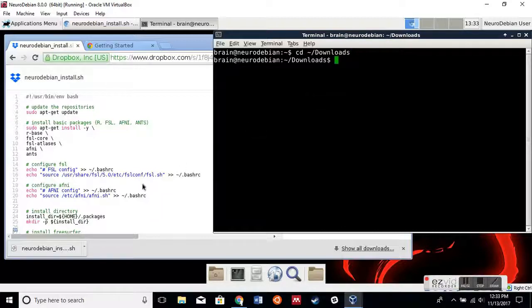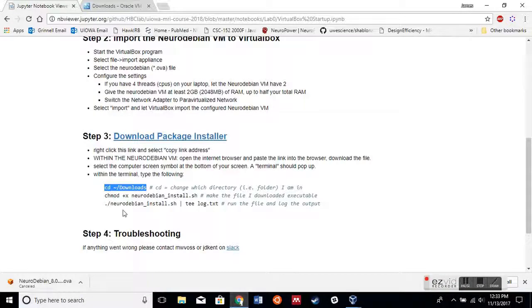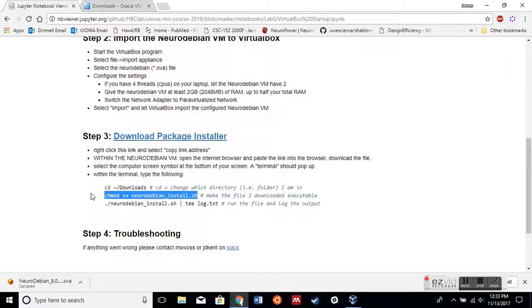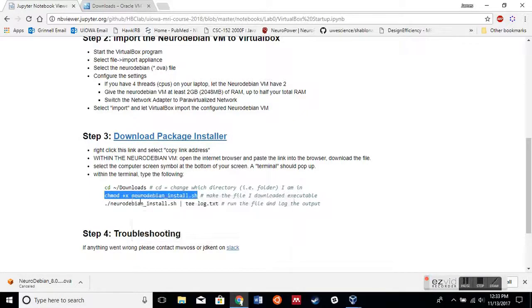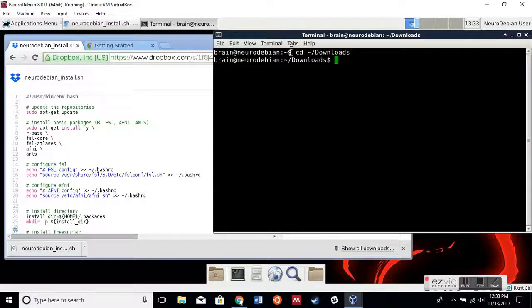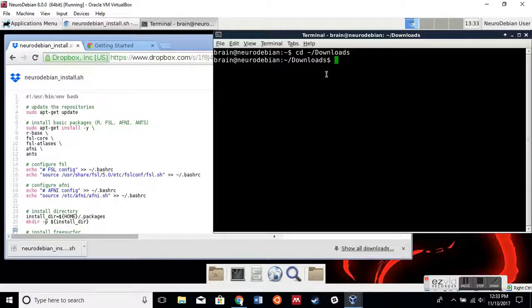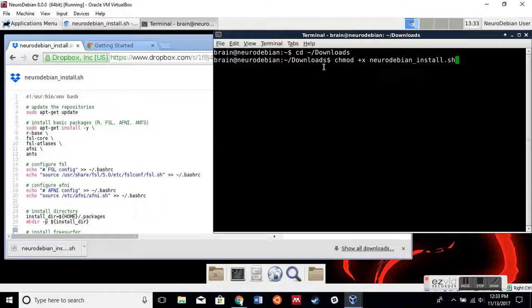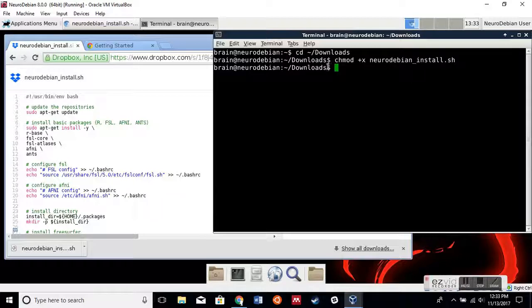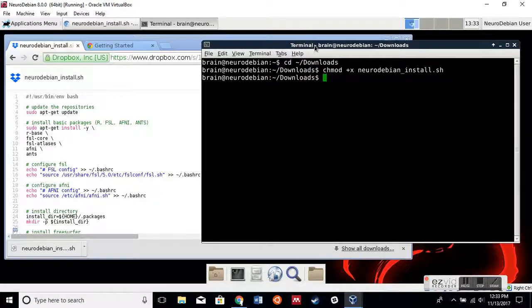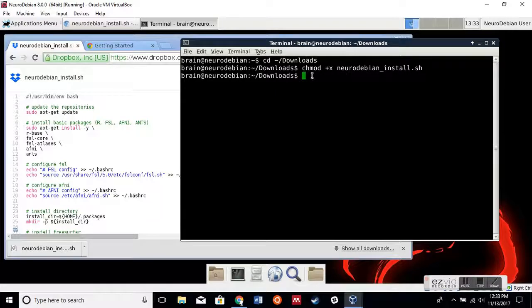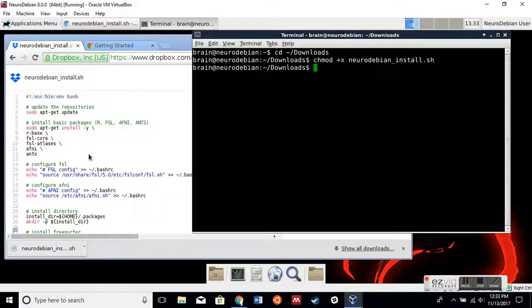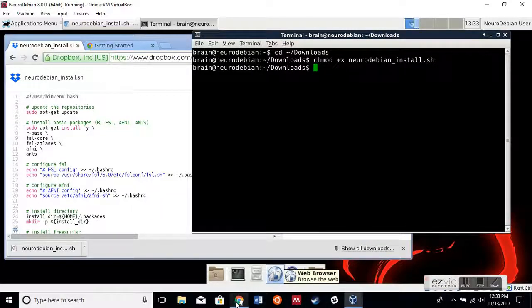Then when we're in Downloads, this is where this file that we downloaded is located. By default, Linux operating systems do not make these files executable because, as we saw when we tried to download it, it said this file can be harmful to your computer, which just means any file that you download from the internet could potentially ruin your computer. But I made this file, so you guys can trust me, I hope. So chmod just means we can make the file executable.